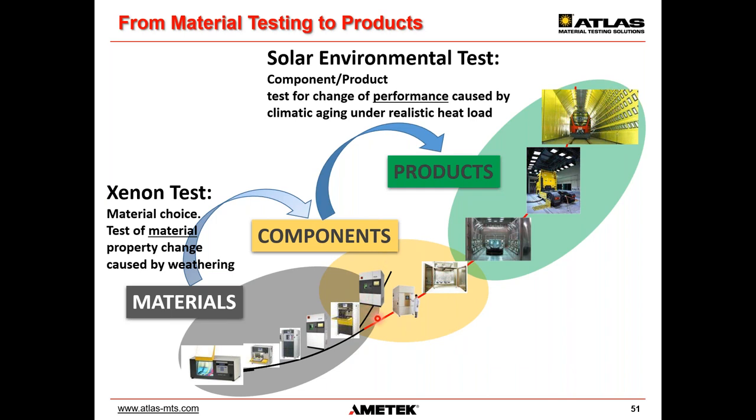Many people like to put components in a SunTest XXL, for example, because they want to get the benefits of filtered xenon solar simulators inside. But then it's really a durability test, for example.